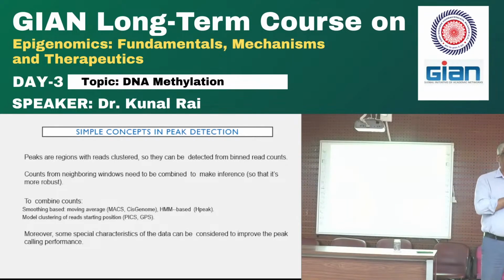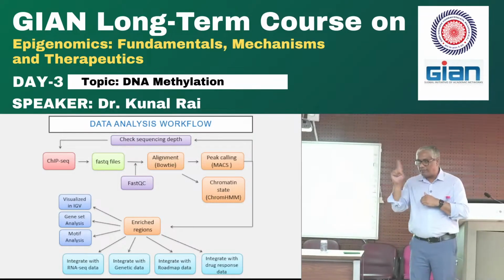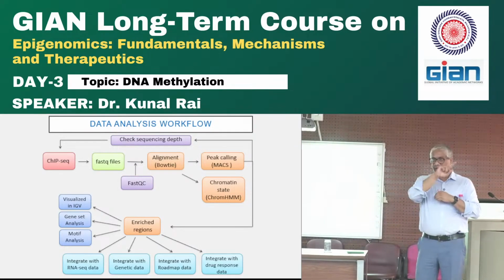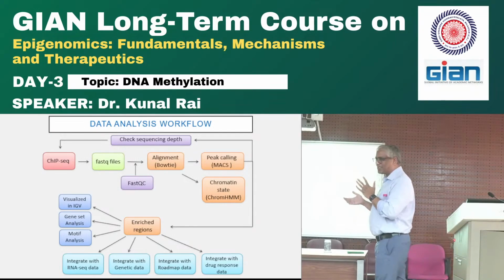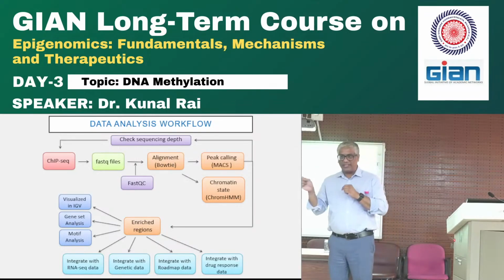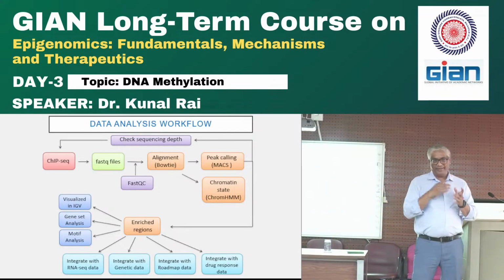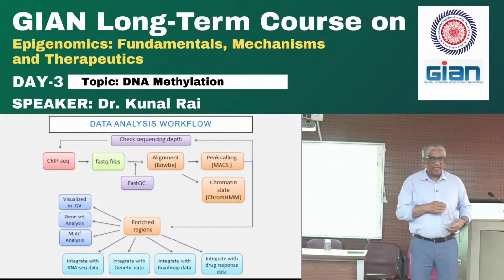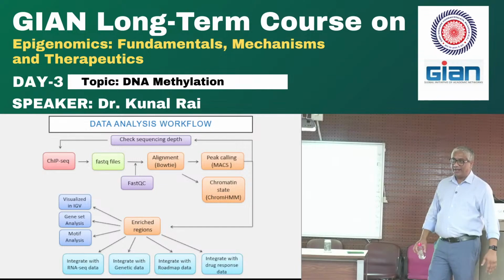So it is essentially lines. If you imagine your Excel file, you imagine your columns, each row has a sequence in it, okay? Just imagine that to be a text file now. You can save an Excel file in a text format, right? A text file which has sequence after sequence after sequence is a FASTQ file, okay? Because I have about 20 million reads that I got out of my data.